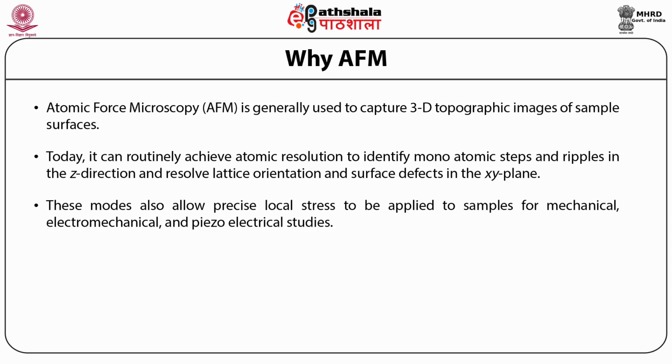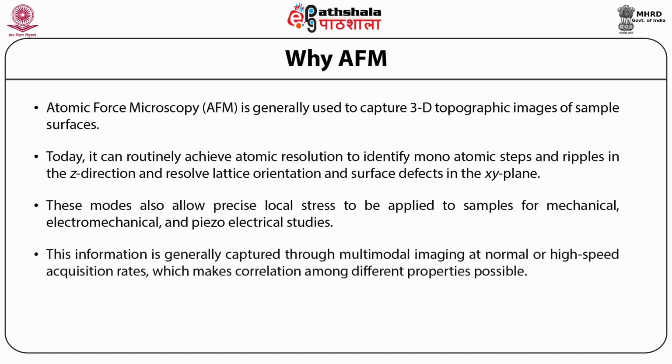Advanced AFM modes allow researchers to capture maps of modulus, adhesion, deformation, conductivity, surface potential, permittivity, optical absorption and reflection, electrochemistry, etc. This information is generally captured through multimodal imaging at normal or high speed acquisition rate, which makes correlation among different properties possible.